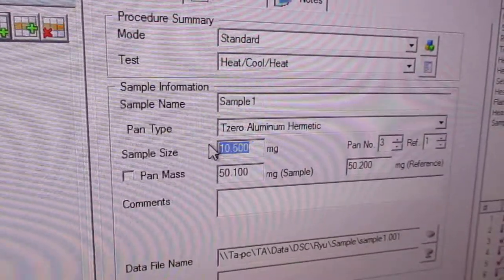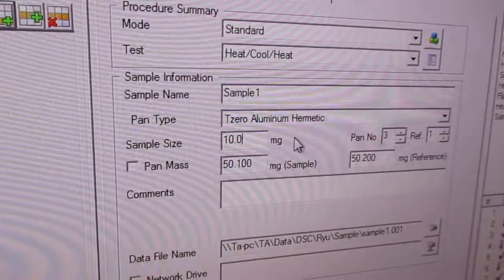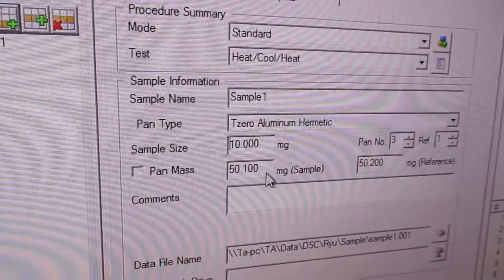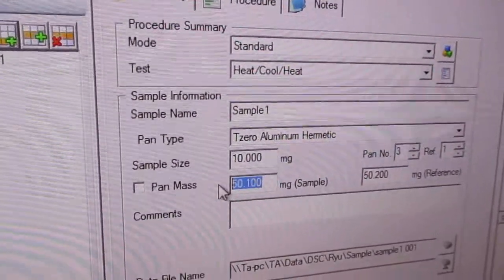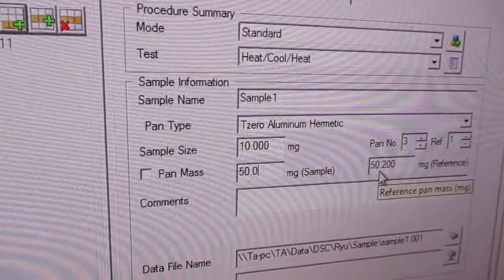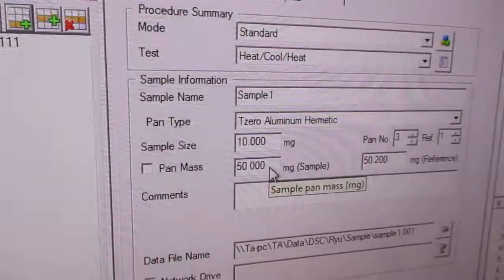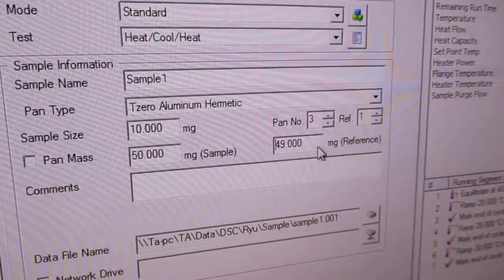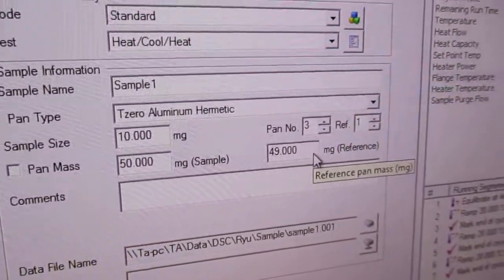Now you enter in your masses for your particular samples. So for our sample number 1, we enter in that mass of the sample alone. So you take the difference of those samples that we had taken on one of the prior videos of the sample plus the pan and lid, and then the empty pan and lid. Now this next mass is that empty pan and lid of that sample. The third and last mass is our sample reference. That is our reference pan and lid mass.